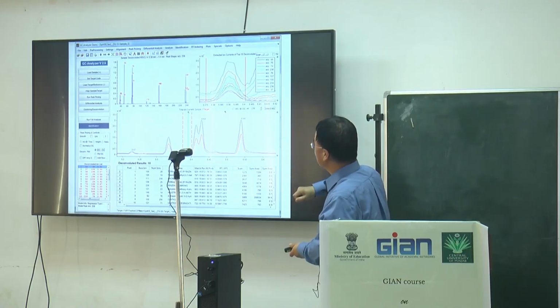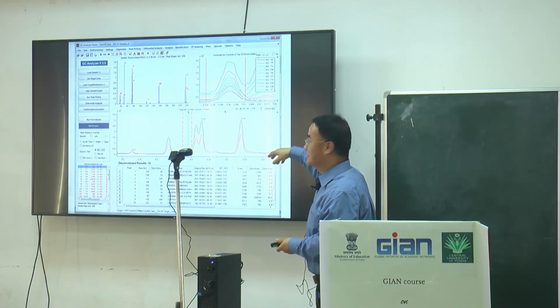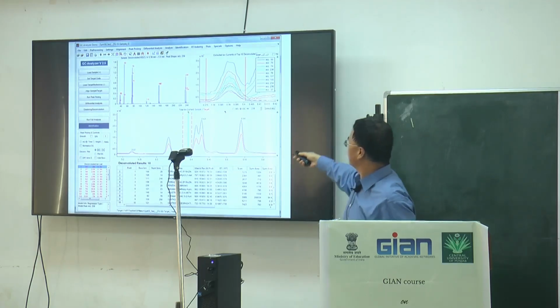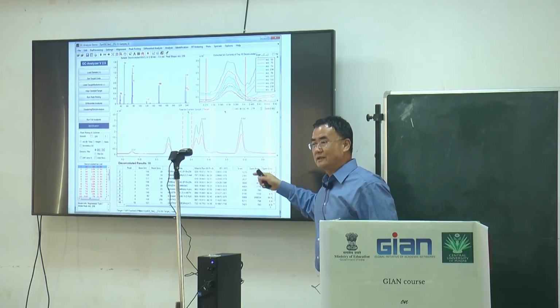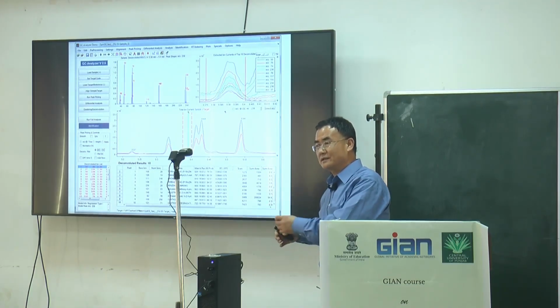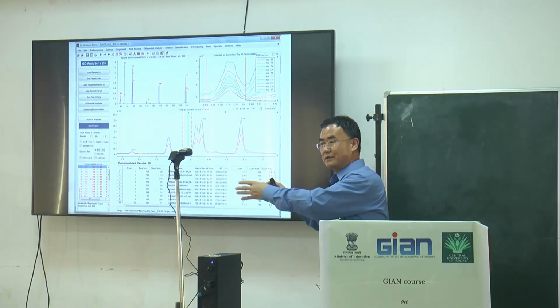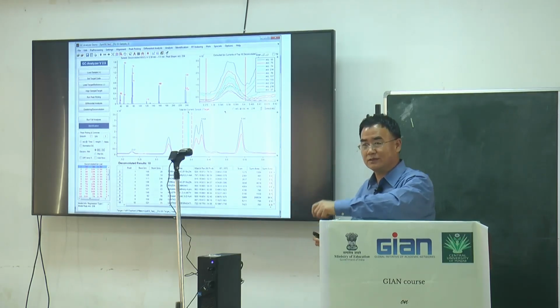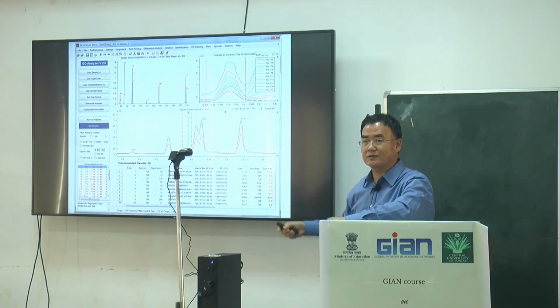You want to extract the data, or click on this peak and quickly show the mass spectra or the m/z ratio, and it also gives you the best match of the predicted molecule from their own library. Then you can analyze in detail what the published papers show for similar molecules, whose retention time is very close to your materials when you use a very similar capillary column.